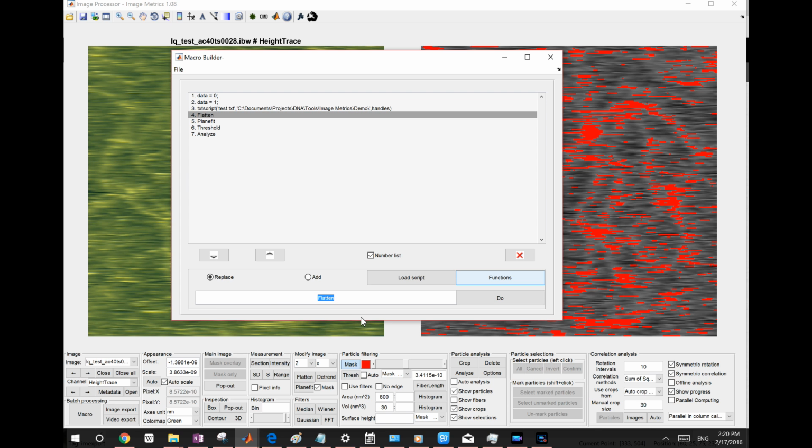For example, I want to change the filters of area. Say area mean, that would be the minimum area. The variables are given in the application program interface documents, so you can look at that and check what the names are.